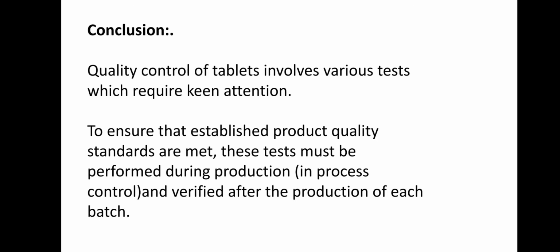Conclusion: quality control of tablets involves various tests which require keen attention to ensure that established product quality standards are met. These tests must be performed during production, in process control, and verified after the production of each batch.